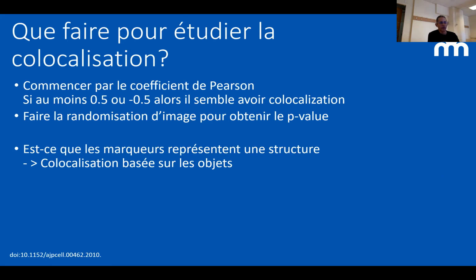So how do you work on colocalization? There are a lot of aspects that are related to how you take images and to the microscope. This is too long to talk about today, so I didn't put the emphasis on this, but there is a very nice article that can give you all the pitfalls and the things to avoid when you are doing experiments for colocalization.